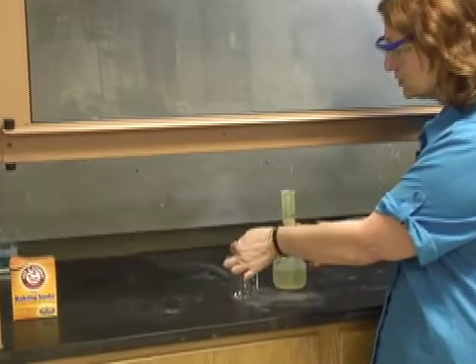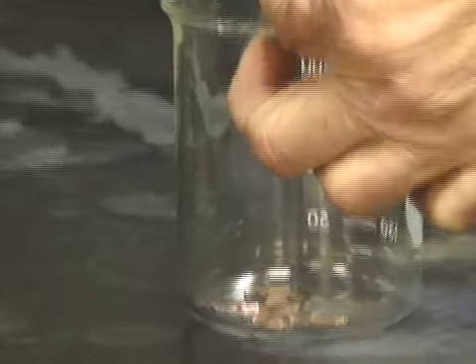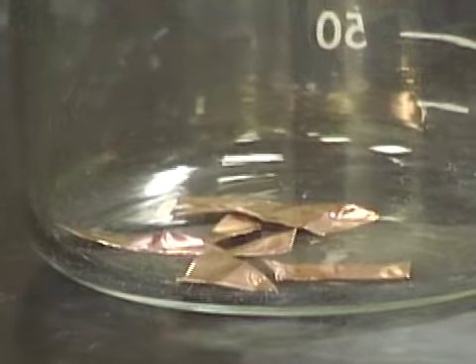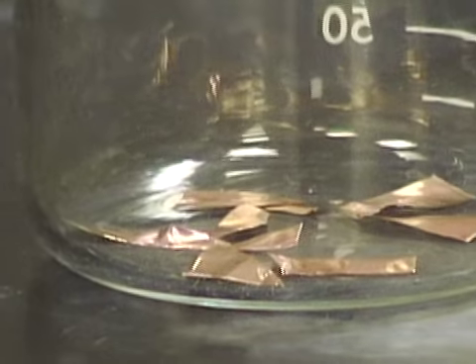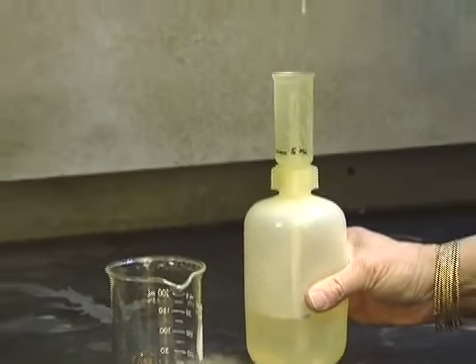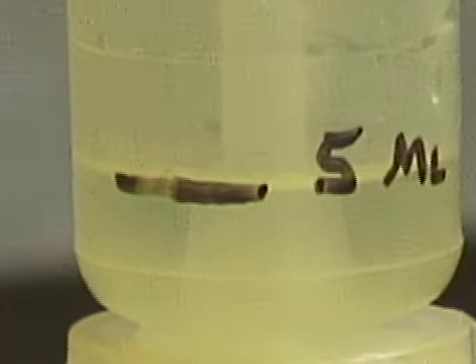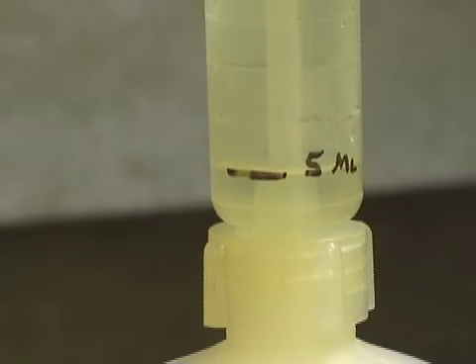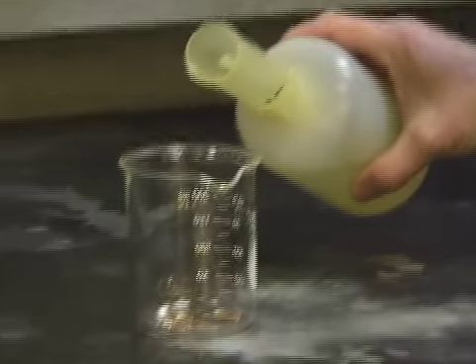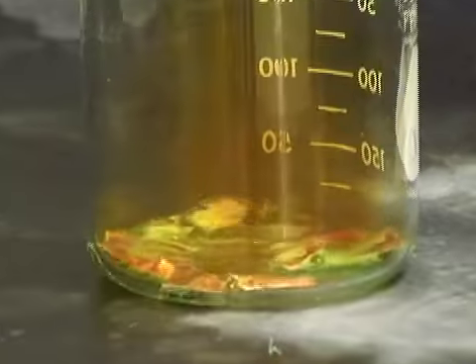I will add it to my clean, dry beaker, and I will cut it into smaller pieces here, and then I will go ahead and add the nitric acid. We have a very interesting container here, and all I have to do is squeeze the container and it will come up to 5 milliliters. The procedure called for between 4 and 5 milliliters, therefore it's not a critical volume. So I will just pour it in here. Now let's watch this beaker as I pour it in.